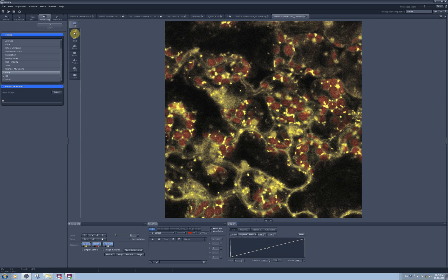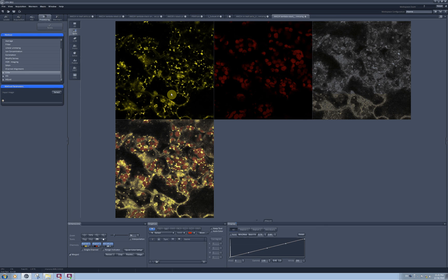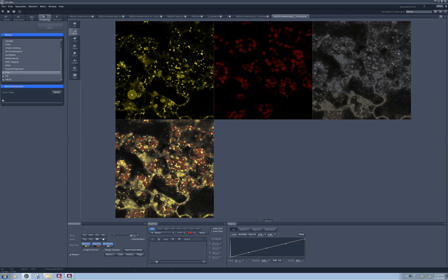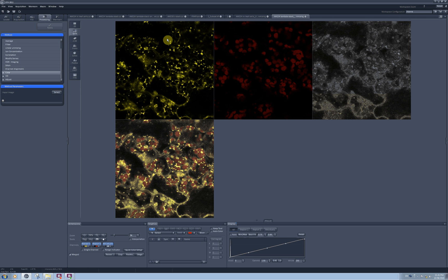And here is my unmixed image, and you can see that I didn't lose as much information from the YFP channel now because I had a much more accurate unmixing.